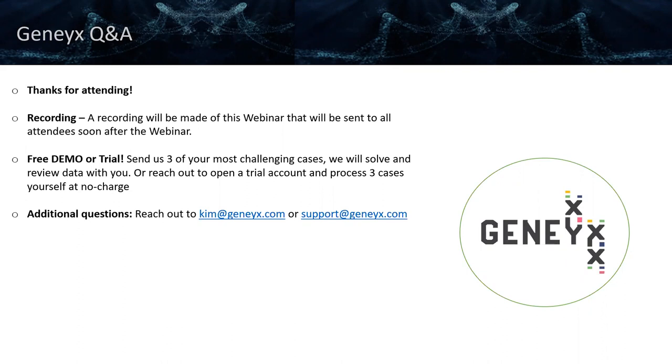Okay, it looks like we have time for one more. Does Geneyx Analysis have an API interface? Yes, we can definitely reach out and talk to you directly, but we actually have some script repositories on GitHub, which allow you to automate the processing of FASTQ, integrating it into the Geneyx Analysis platform, as well as integrating with LIMS or electronic health record systems. So we can talk directly, but the answer is yes, we do have an API integration.